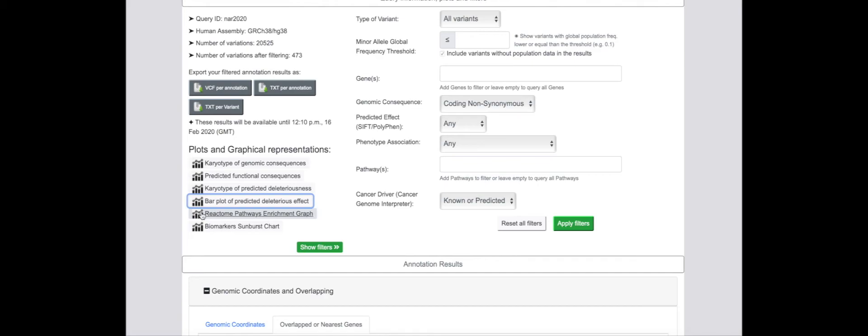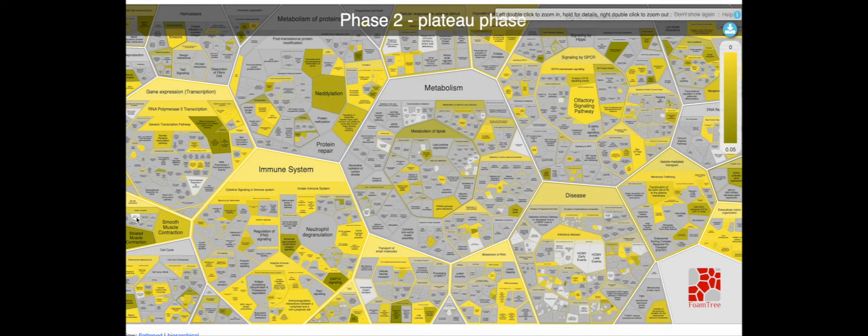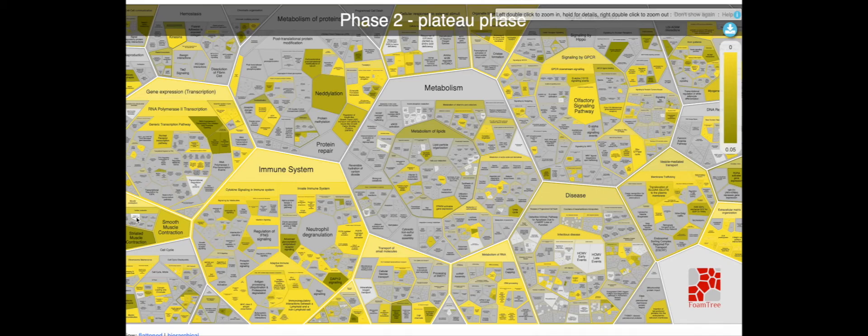Enriched signaling pathways can be identified using the pathway visualization tool, which allows users to zoom in on specific pathways of interest.